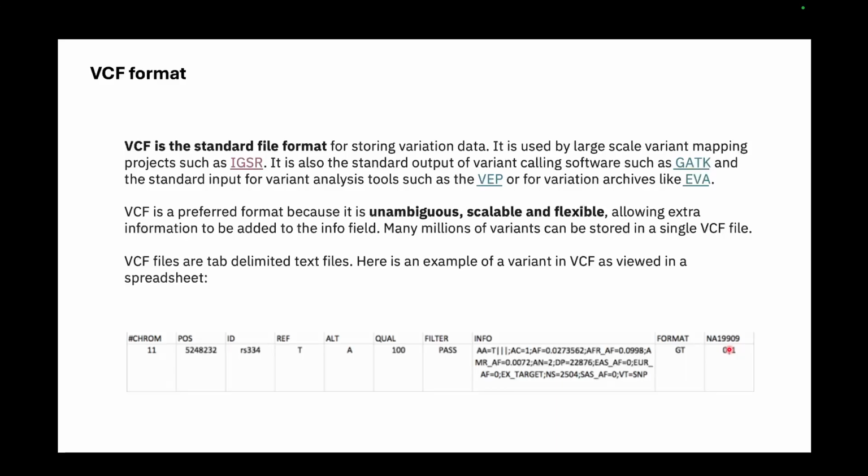If there is no phasing, you do not know which strand it is in, but you know it is present in one strand, but it is not present in another. So you'll have this slanting type of slash, 0 1 or 1 0. So in case of a phased genotype, 1 0 and 0 1 are different. But in case of an unphased genotype, 1 0 and 0 1 are the same, which is telling you it's a heterozygous variant.